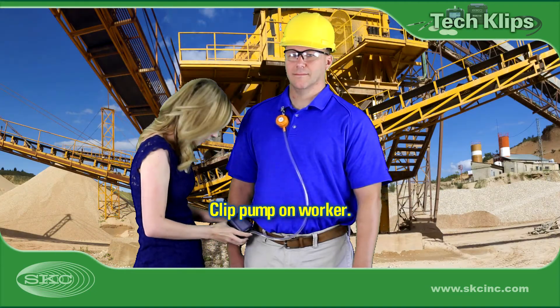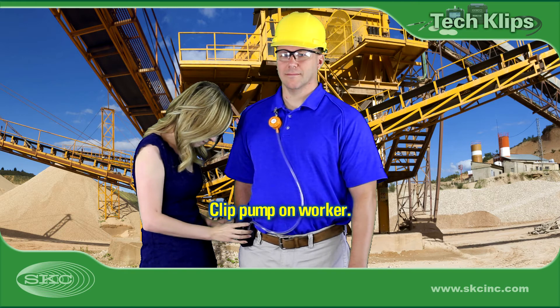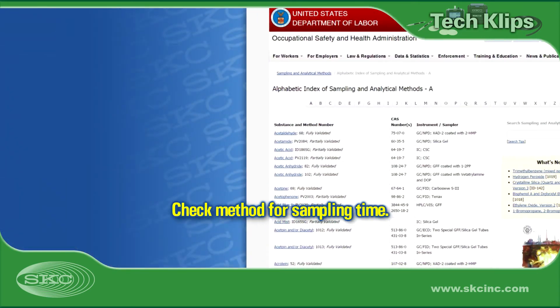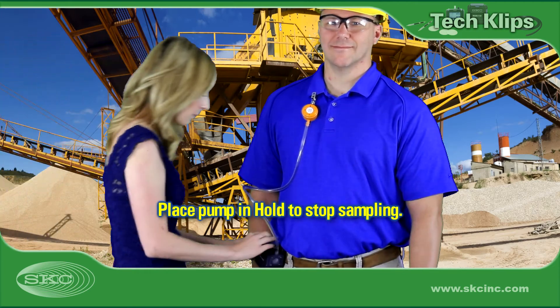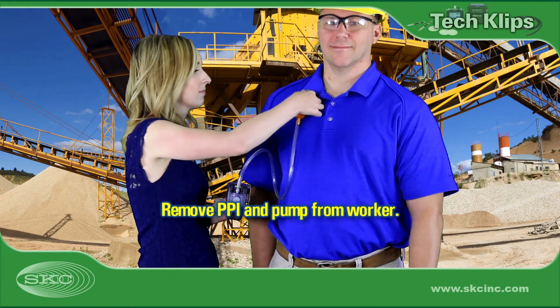Attach the PPI in the worker's breathing zone. Clip the pump at the worker's waist where it will not inhibit movement or sampling. Turn on the pump. Consult the method or your laboratory to determine the appropriate sampling time based on the analytical limit of quantification. Stop sampling by placing the pump in hold, then remove the sampling train from the worker.